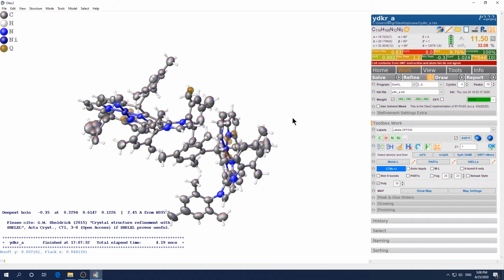So basically, if good data comes in, you can get a good outcome, but if it's garbage in, you get garbage out. So I cannot stress enough that you have to spend enough time to get a very good data set. If you have a good data set to start with, you won't need to go to this much trouble trying to make it look better. In this case, I still don't recommend this to publish, but I'm just trying to see if we can make it look better. This experience will be useful for the future.